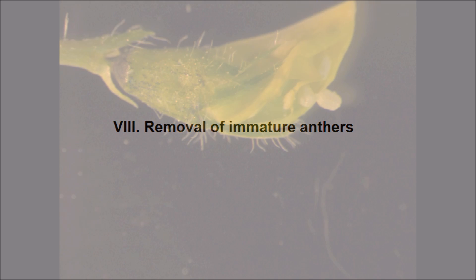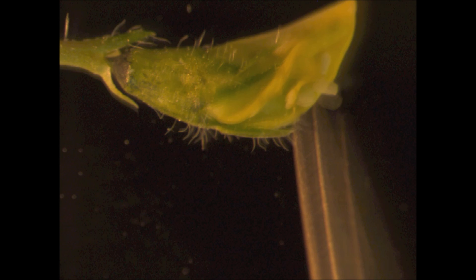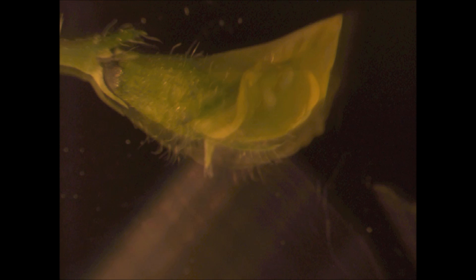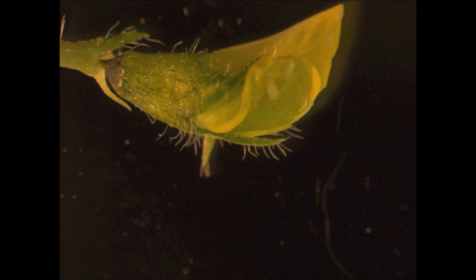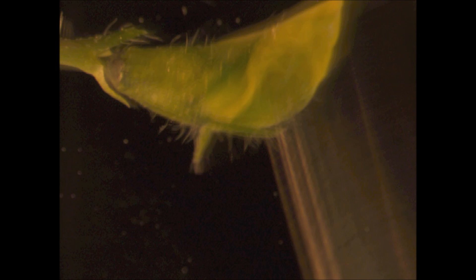To remove the anthers, use the fine forceps tips and gently push out the anthers from the sexual column. During removing anthers, make sure that you don't rupture the anthers to accidentally release pollen grains onto the surface of the stigma, which could cause self-pollination.